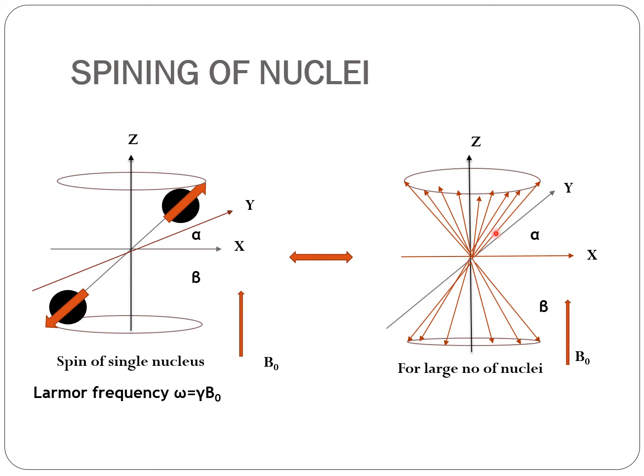Thus, these two states can be differentiated, and thus we get an NMR signal. Only when there is a difference in the Boltzmann population distribution do we get an NMR signal. So that is why we are getting an NMR signal now.